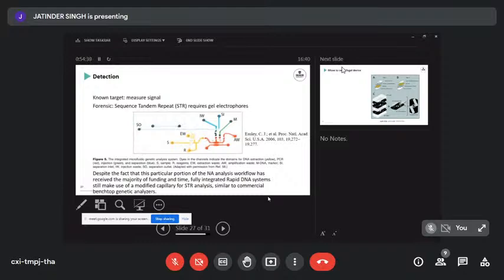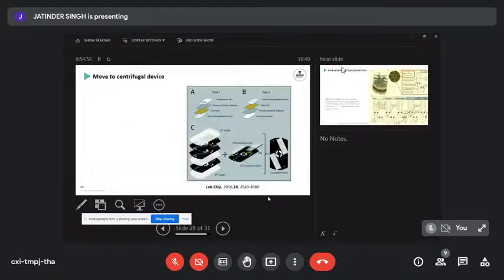And then manufacturability came in. They found out that this hot embossed cartridge was not really easy. Then they started thinking about their fluid handling and how big the pumps were. And then they sat in a corner and cried really loud. Then they realized that maybe centrifugal systems are better than pump-driven systems, so they had to redesign everything. They went to a centrifugal platform because they couldn't combine the pumps with a microfluidic system in a way that economically made sense.